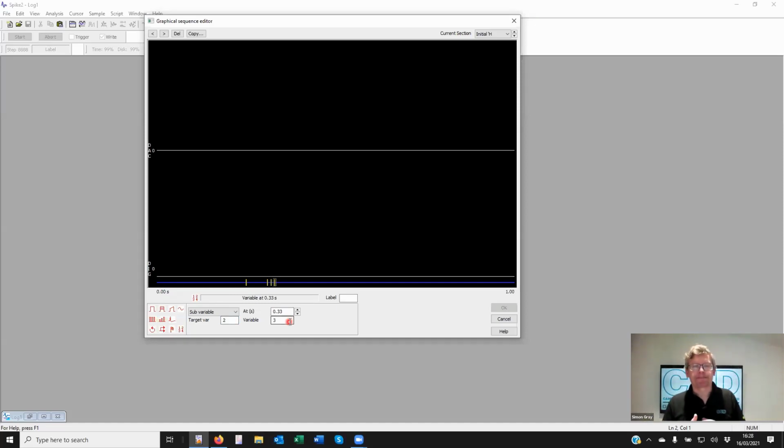That was an attempt early on today to try and reset the time into sampling for something else I wanted to show you. But here it's not going to work in quite the way we would expect. And that's where extra commands within the text sequencer would make things easier. Now we often don't expect people to use the graphical sequencer and lots of variables. It's not really tuned for that purpose. But I'll show you what we can do with a variable.